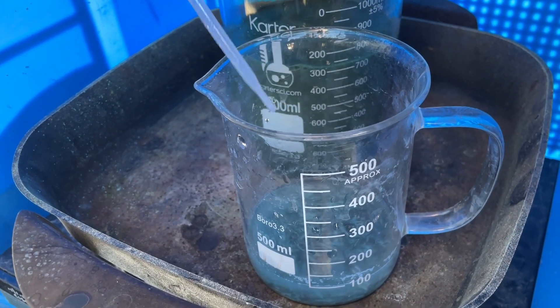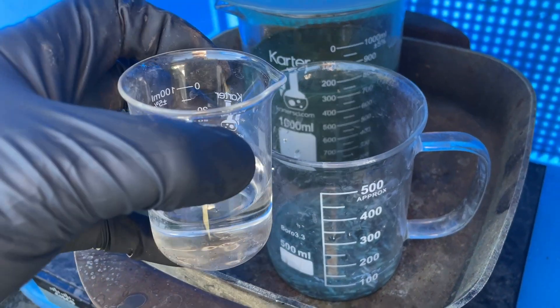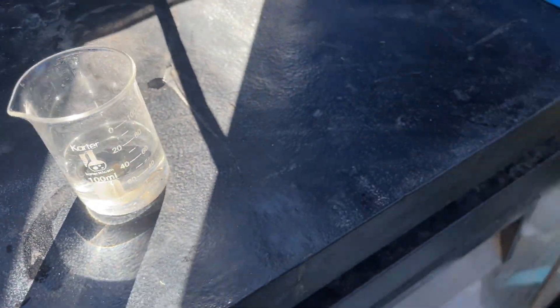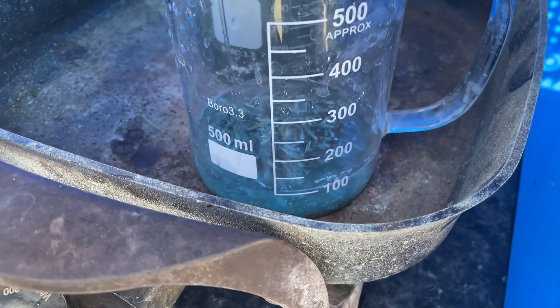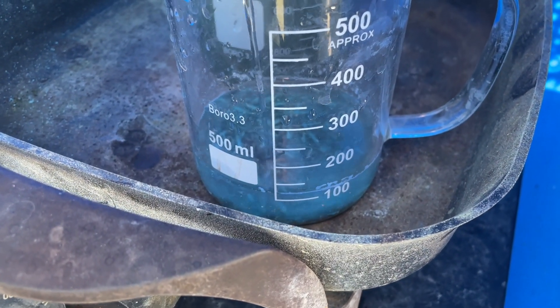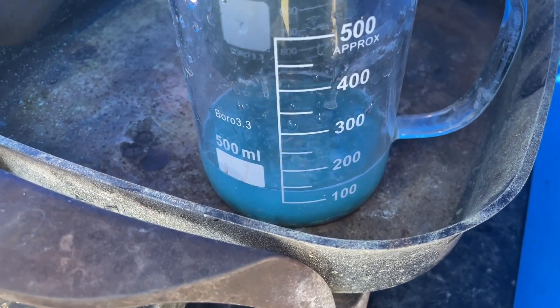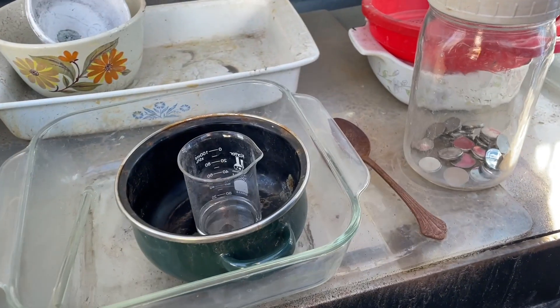Okay, about three squirts — I'm going to grab the whole container. We got about 50 mL in there. Let's hit it good and proper. We got about 30 mL in there now — that should really get it ripping as we need it.